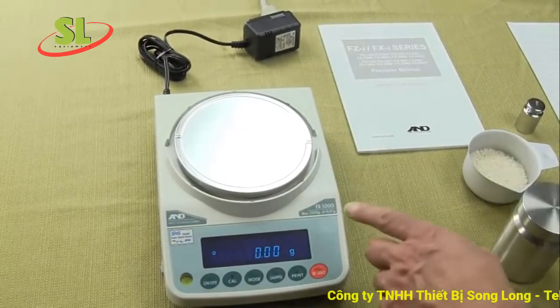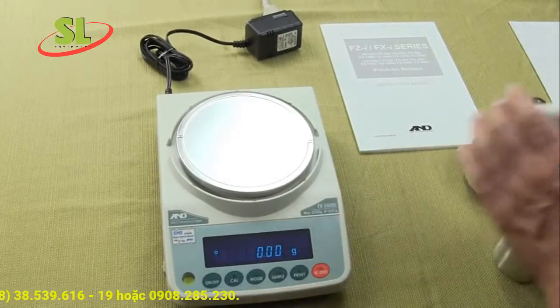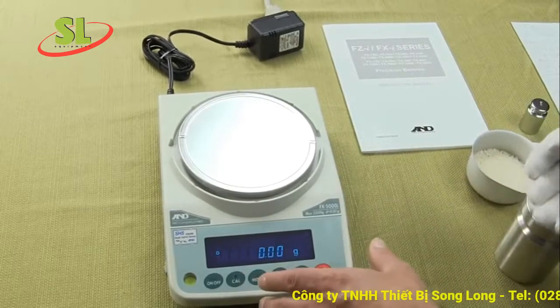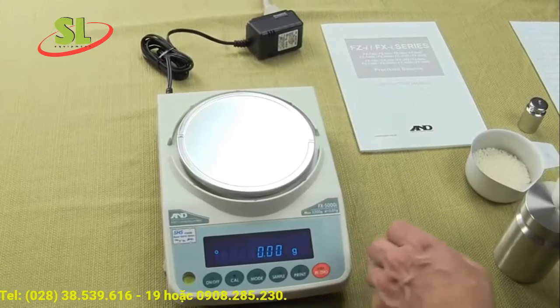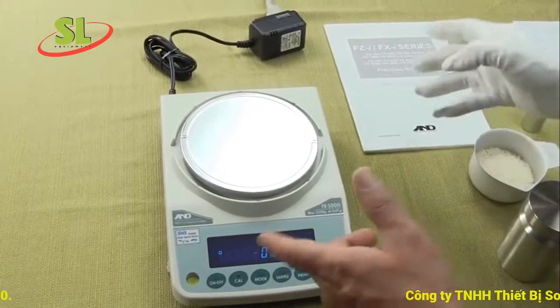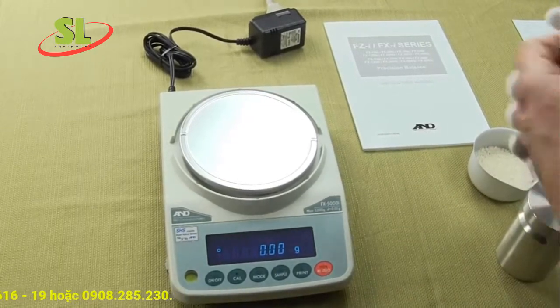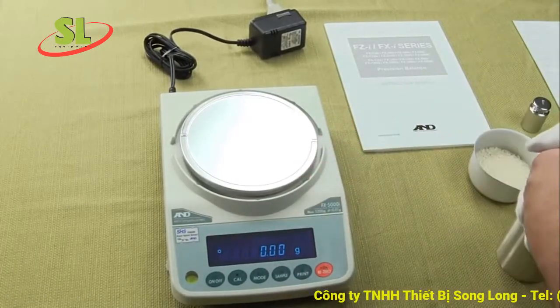The balance at 0.01 gram readability does not come with a draft shield. There is an option: you can buy either a 3.4-inch high or a 7.9-inch high draft shield. The milligram balances in the FXI or FXZ series come standard with a short 3.4-inch draft shield. It's a nice, affordable option to prevent air currents. You can visit our websites at balances.com or scaleman.com for all accessories.